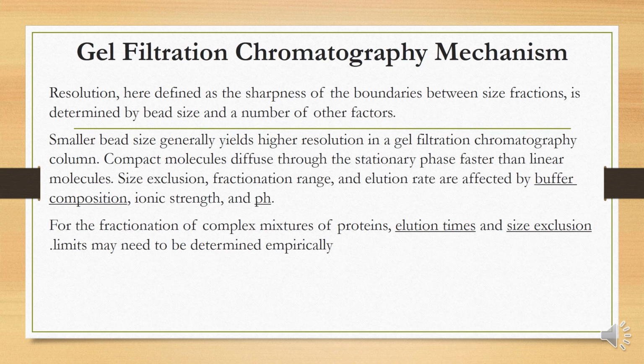Size exclusion, fractionation range, and elution rate are affected by buffer composition, ionic strength, and pH. For the fractionation of a complex mixture of proteins, the elution and size exclusion limit may need to be determined empirically.